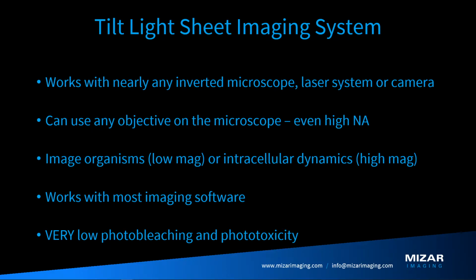Since the sheet is fixed, the only thing you have to control is the stage. And the stage can also just be controlled with analog voltage. Makes it very easy for most software packages to incorporate the tilt into it.